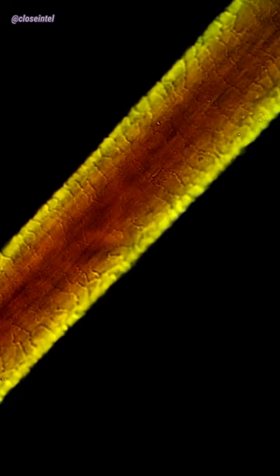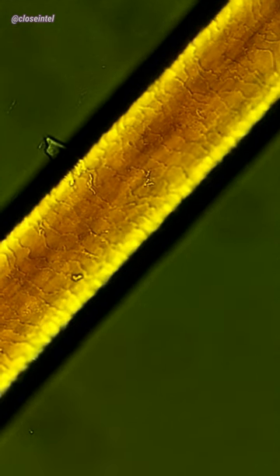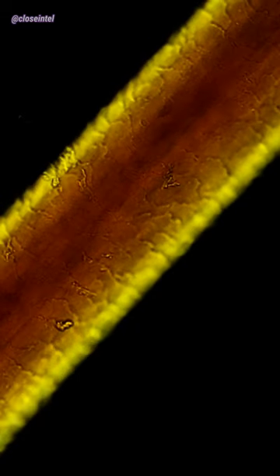This is the outer layer of the hair known as the cuticle, and what we're seeing is the cuticle scaling. All of the scales point towards the tip of the hair, which are formed from dead cells overlapping in layers to protect the hair shaft.